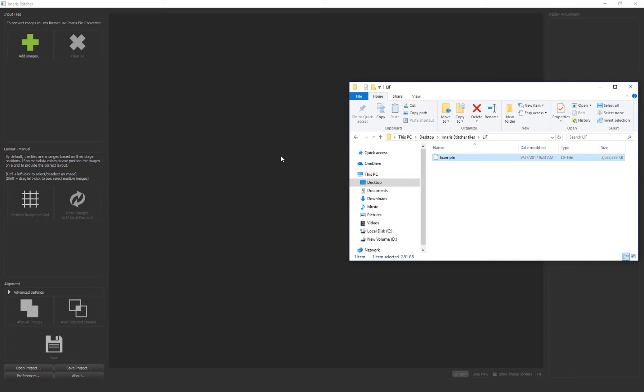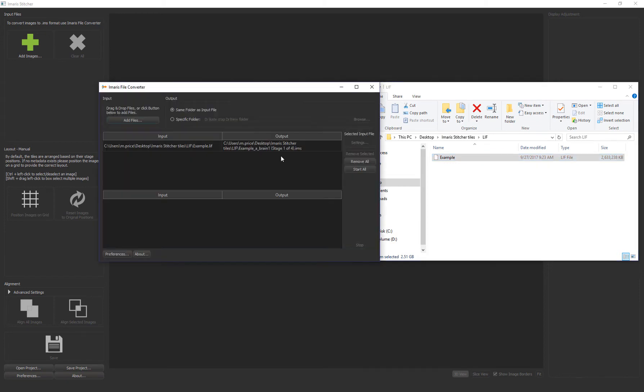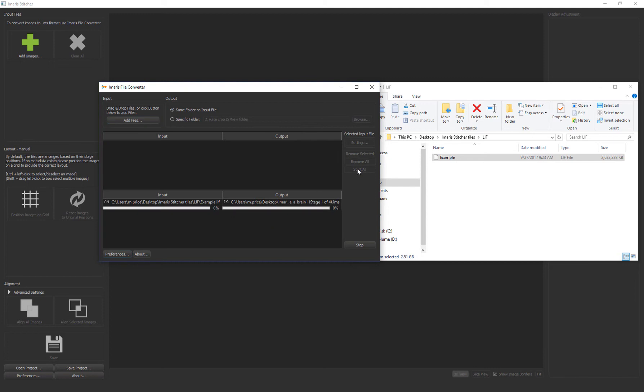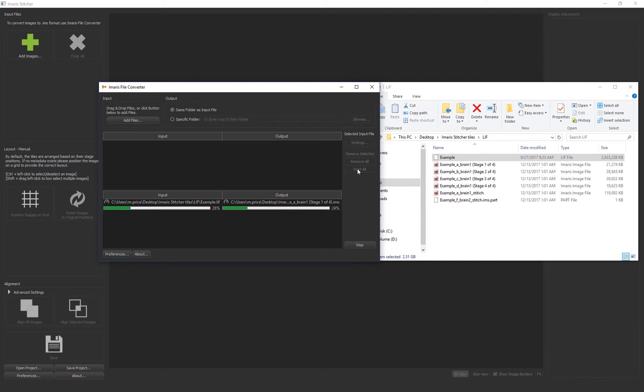You can see that once I drop the file Imaris file converter appears and the image is automatically loaded there, and then I hit start all to begin the conversion. Once the files are converted into Imaris files I can drop them into Stitcher. I'll show you this next step with a different set of tiles.